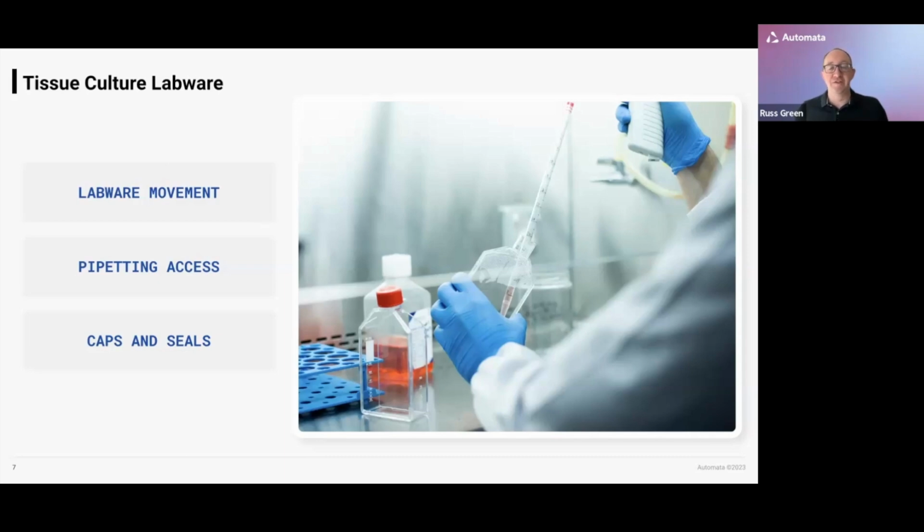So first of all, and you'll see most of my conversation today is going to be about adherent cell culture. And that's where we see an abundance of these very recognizable TC flasks. And you can see, even just from this image, some of the challenges that presents. We as humans have to hold them in a very particular way, especially if we want to get all the liquid out, using a pipette that's very long and has to go through quite a narrow neck. So there's all these challenges presented by that piece of labware, which, of course, are solvable through automation.